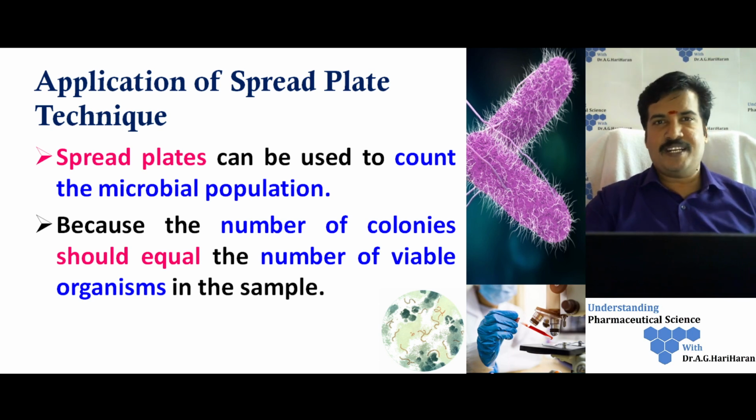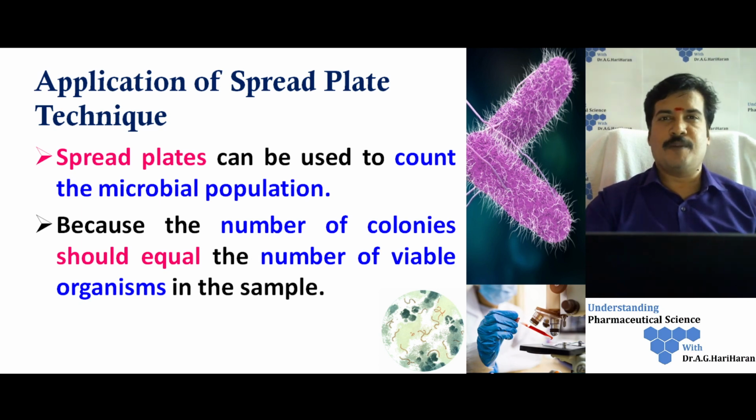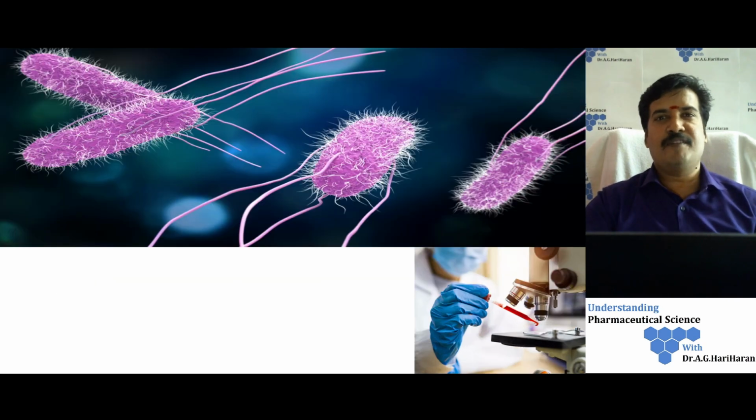The spread plate technique is the easiest way for isolation of pure culture and to do various other activities in microbiology, especially in the pharmaceutical industries. I think this lecture will be very helpful for you in understanding the spread plate technique.